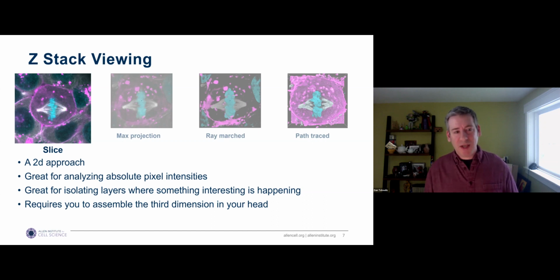So the typical use case is, you will look at one slice, then you will look at the next slice in Z, and then the next slice and the next slice. And often we play them back in a movie as a time sequence, but what we're really seeing is a cross-section moving up and down in the Z direction.